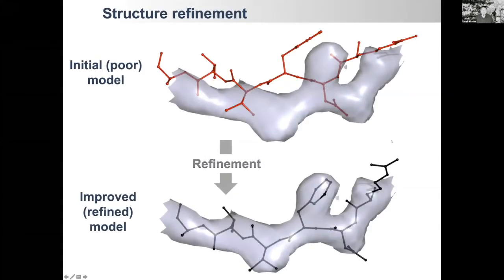So we're talking about refinement, and that's going to be crystallography case. Last time we talked about cryo, that's similar, but not exactly. So what is refinement, right?